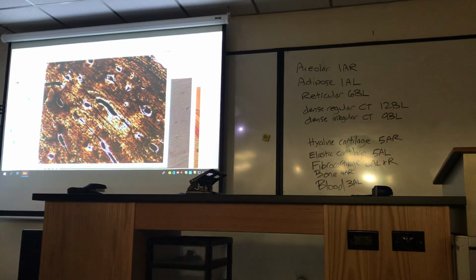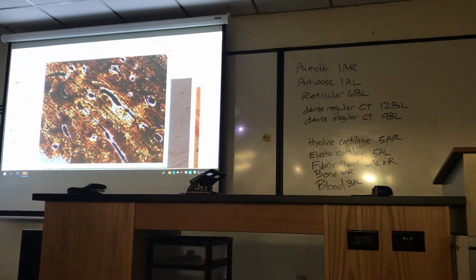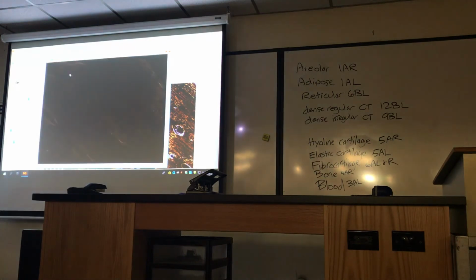That's a pretty good picture. Very dark. This is a 100X. I'll take a picture of the bone for you. Let's see what it looks like at 400.